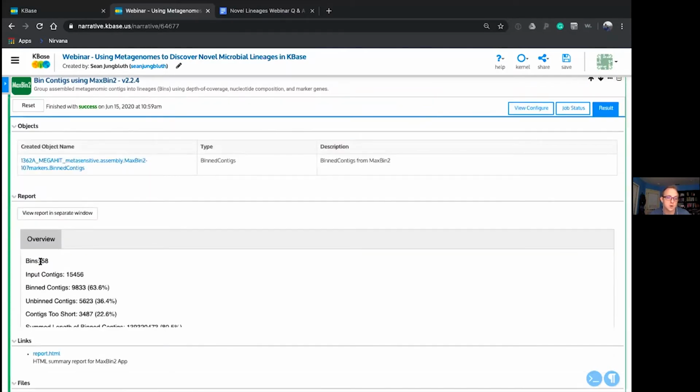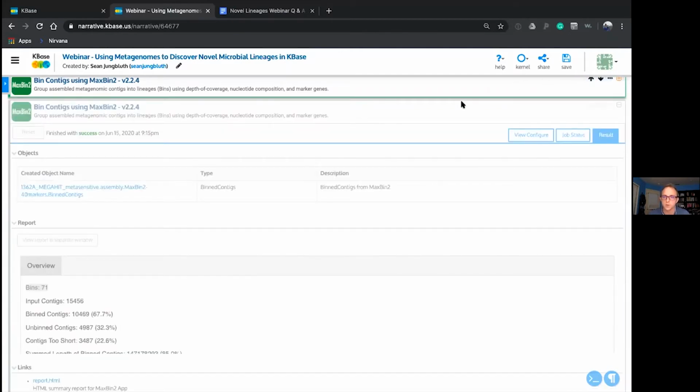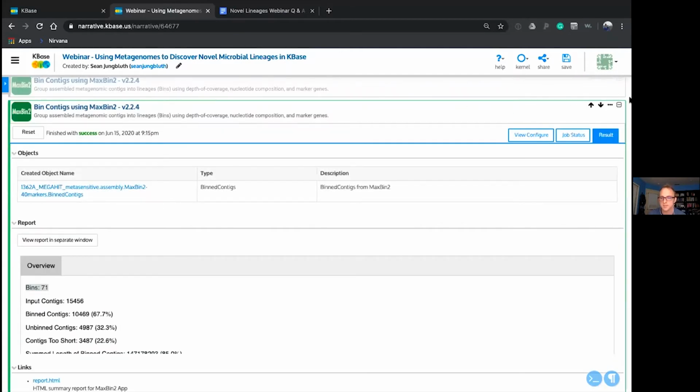Notably, we had to use parameters that were not the default parameters for these tools. And so as you're working through your own data, make sure that you are always thinking about how to tailor these tools for your particular analysis. It's key to the development of the highest level insights from your data.